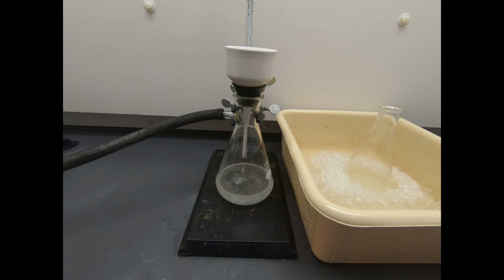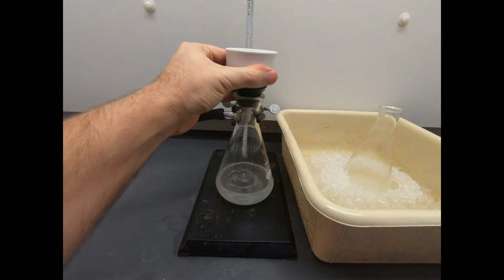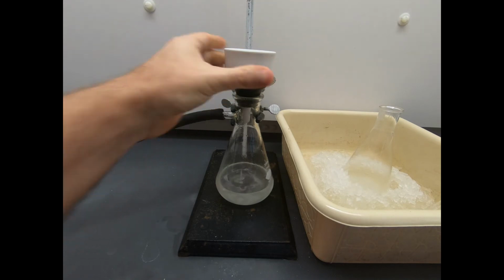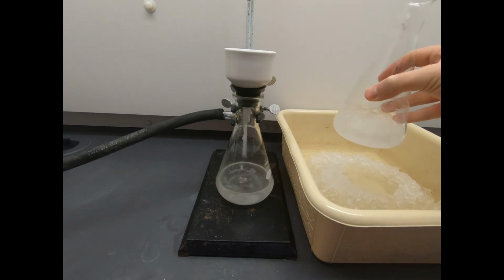Now, as we filter more and more, we get more product coating the filter paper. So the rate of filtration slows down because there's more resistance to the flow as we fill up with solid. That's a good sign. If there were no resistance, we might suspect that we don't have any solid to resist the flow. So it's fine that it's slowing down. That always happens. Oh, and I'm not actually seated very well either. So as this drips, we can take a little more.